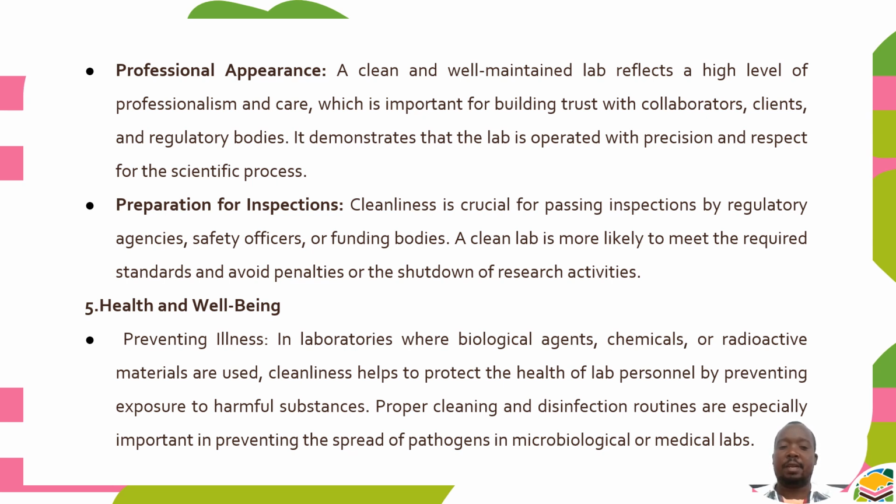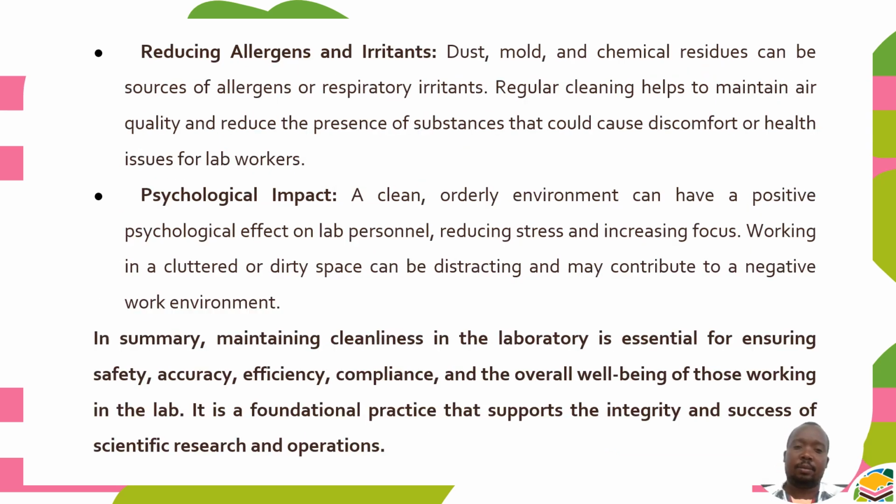This is very, very important. As a lab user, you have to make sure that your health is protected. So it is very, very important. So reducing allergens and irritants, you talk of dust, mold, and chemical residues can be sources of allergens or respiratory irritants. Regular cleaning helps to maintain air quality and reduce the presence of substances that could cause discomfort or health issues for lab workers.